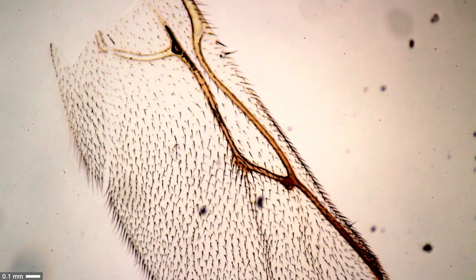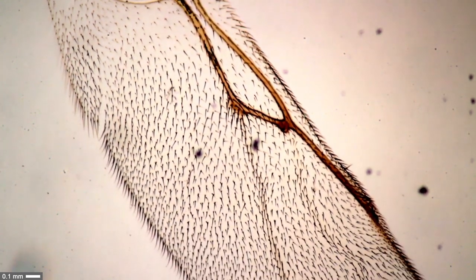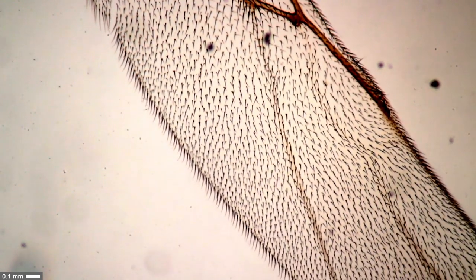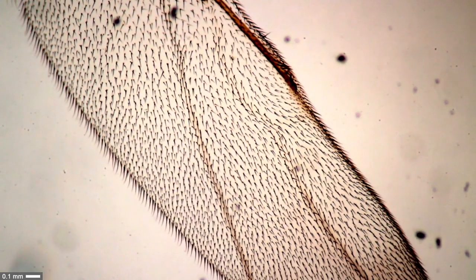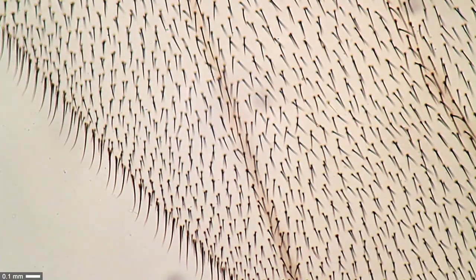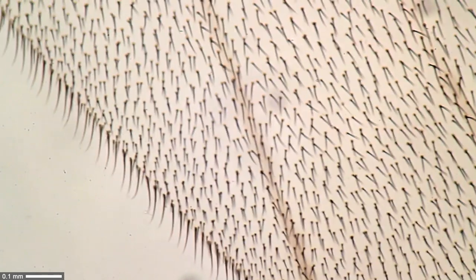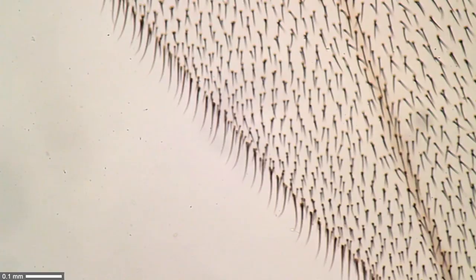This is now the back wing, which is a little bit smaller. It does not have such a pronounced stigma - as a matter of fact, I don't see one at all. Also here we have plenty of hair on the edges of the wing, quite certainly important for aerodynamics. And yet at higher magnification, I decided to compare those entomological needles with the stinger of the wasp. Let's see which one's sharper.